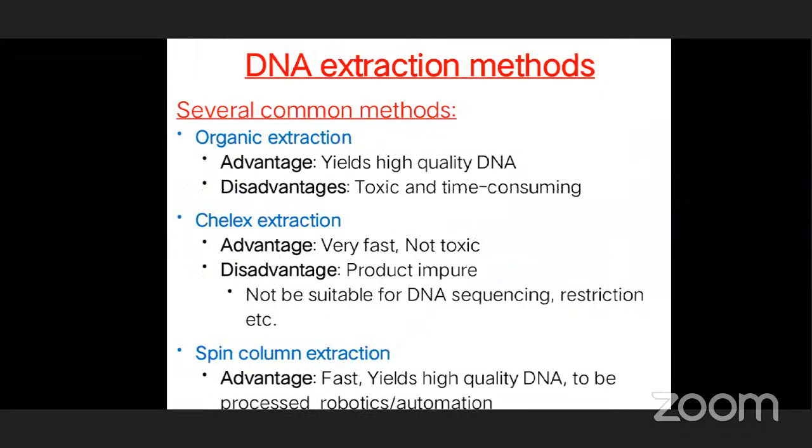Then see the slides. DNA extraction methods. Several common methods are used for DNA isolation. First, see the organic extraction, meaning chemicals are used. What is the organic extraction method? There are some advantages and disadvantages. Here we discuss only a single advantage and disadvantage.